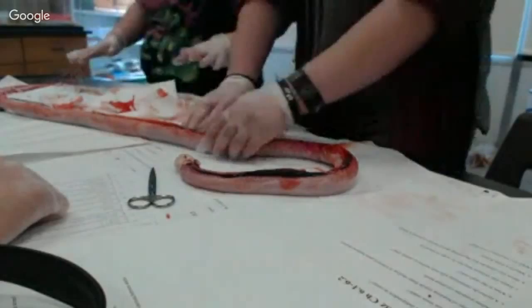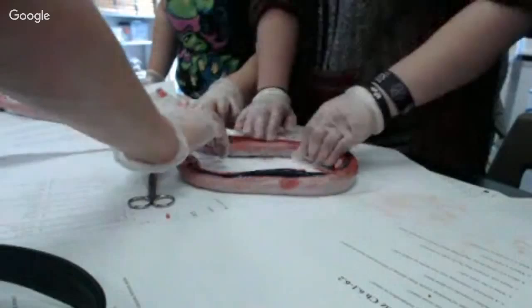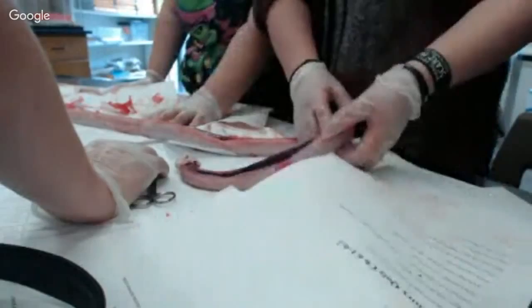Okay, this is a lung. No, it's a lung. The right one is normally bigger. It's the liver. Is it? This whole thing? Yeah, I think so. Are you sure? Yeah, follow the trachea down to the lungs.